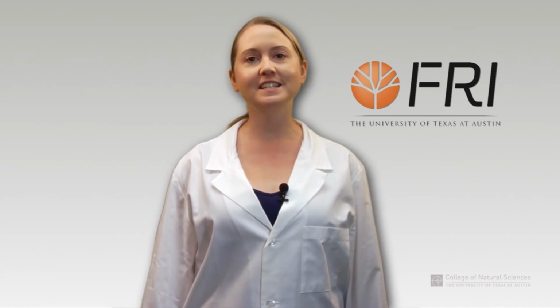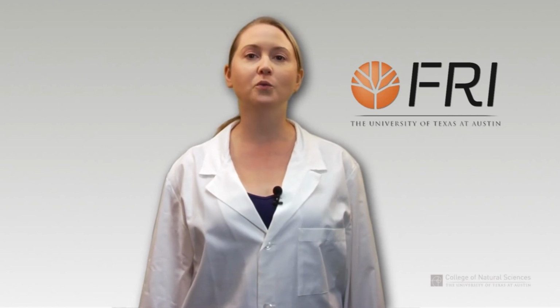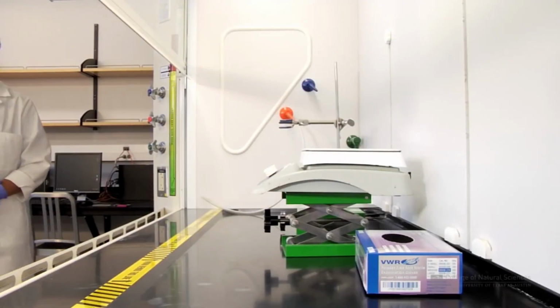Fume hoods are vented cabinets that protect the user from hazardous powders, vapors, and gases. When used properly, the fume hood not only provides respiratory protection for the user, but can shield the user in the event of an emergency situation, such as a fire, explosion, or spill. There are important guidelines to follow in order to use a fume hood safely.